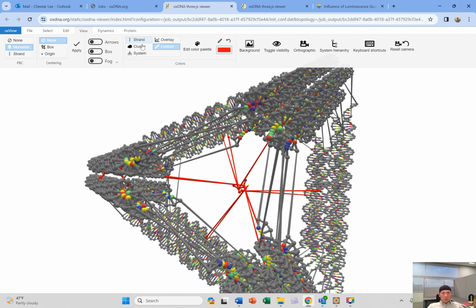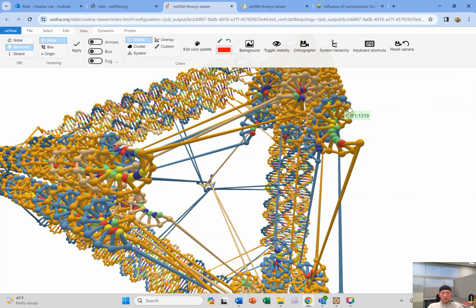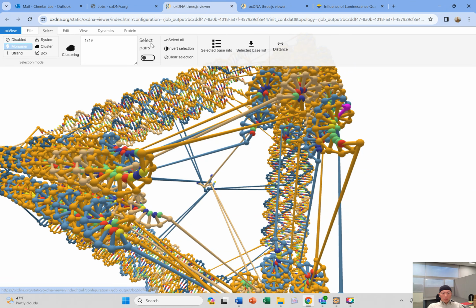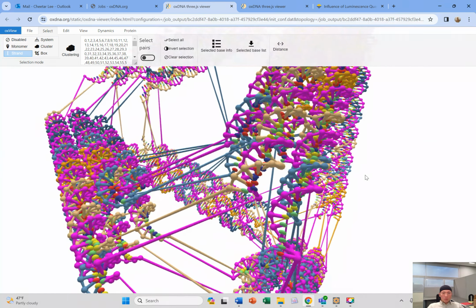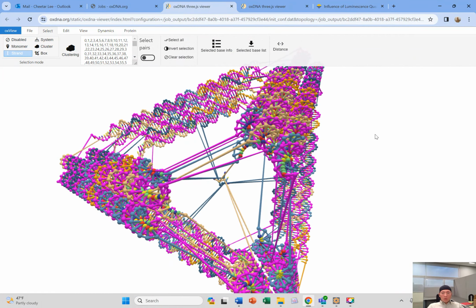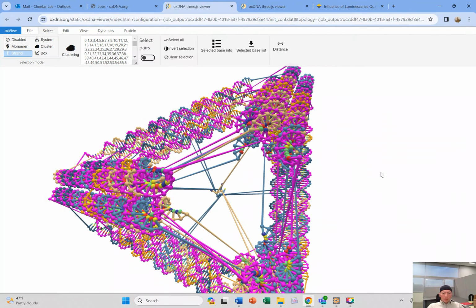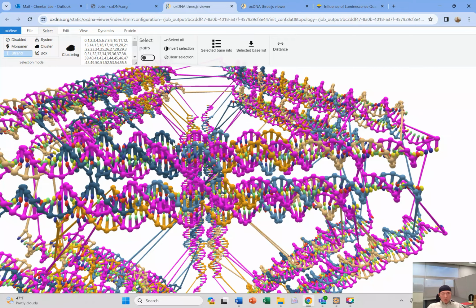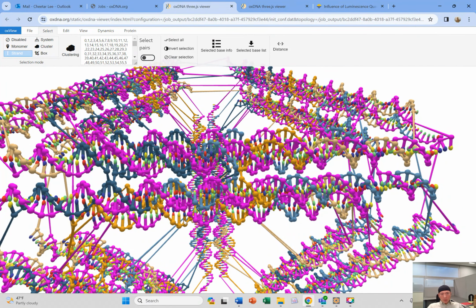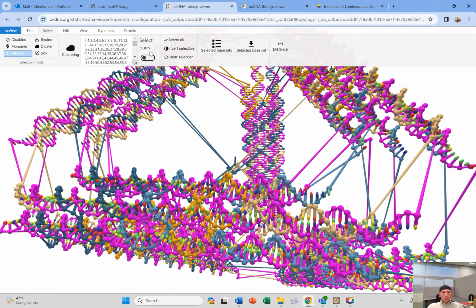So in the view diagram, you can look at each strand, and the colors are not that great, but the scaffold strand, let me select strand. The scaffold strand is one single strand, so if I just click it properly, it will give me the entire scaffold, which is routed throughout this DNA origami nanostructure. Staples are all the other ones, and they run out of colors just like we always do, because there's whatever 200 staples, so they'll just alternate between this dark color and this grayer color and a beige color. You see a beige color here. Anyways, so let's take that view off.